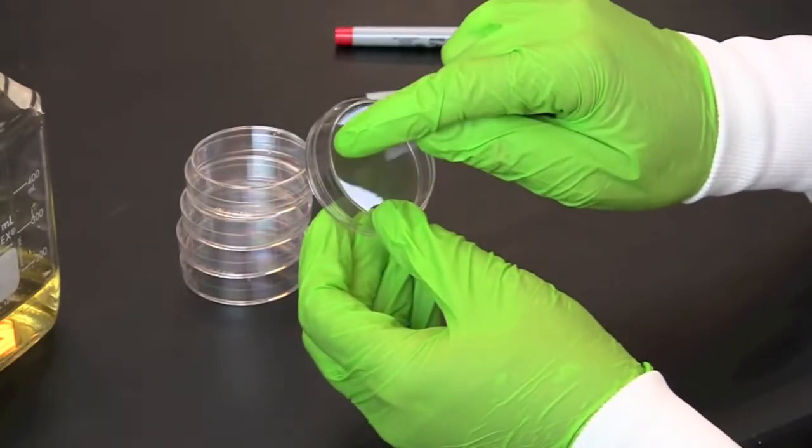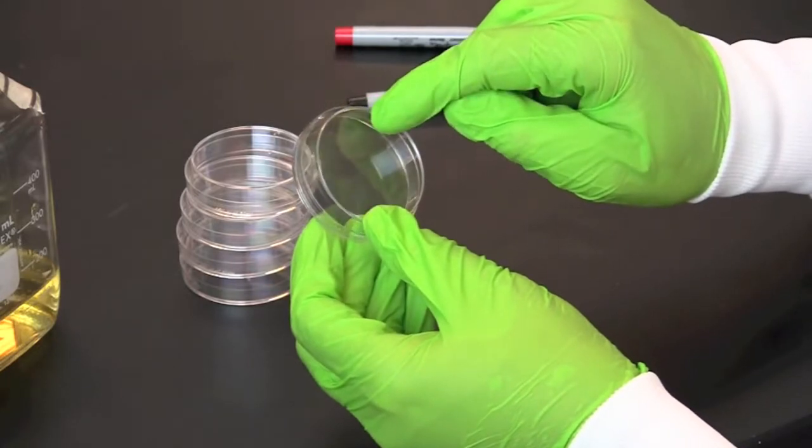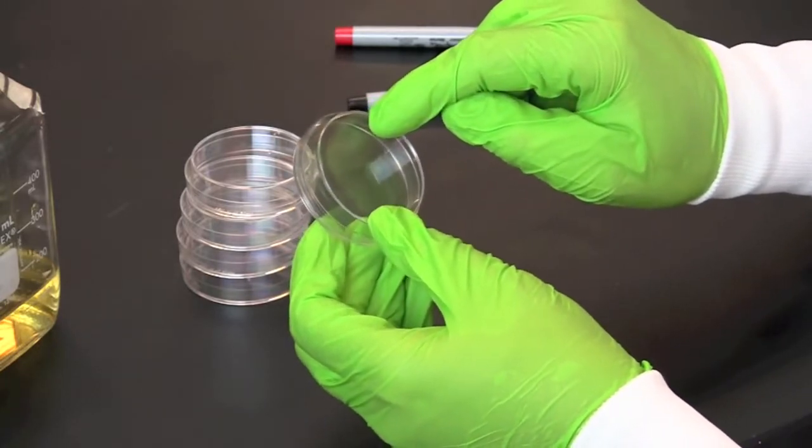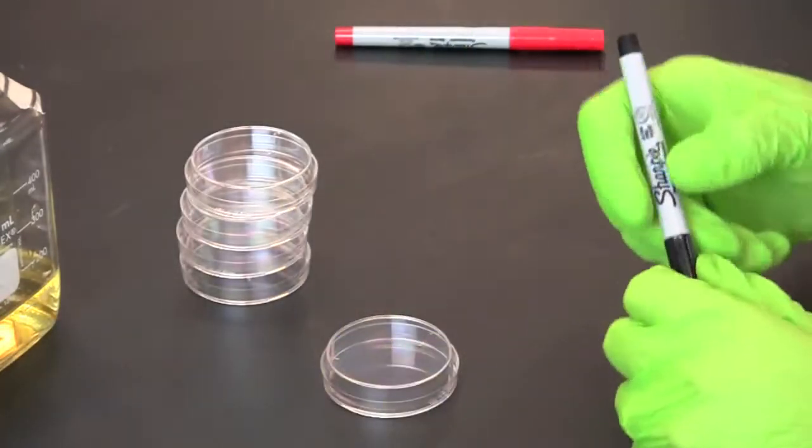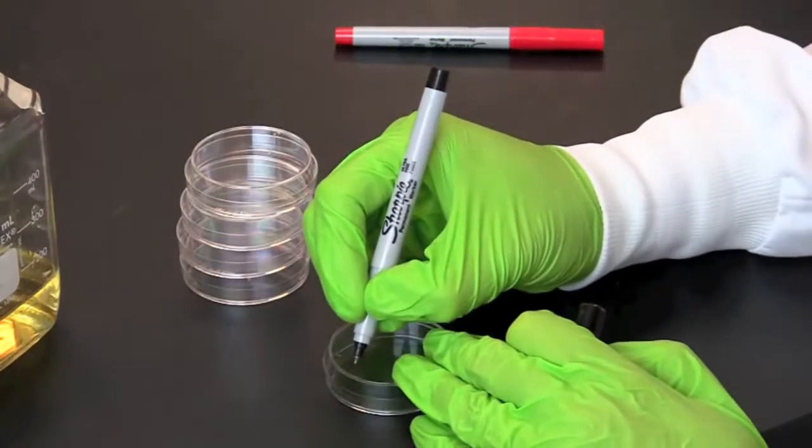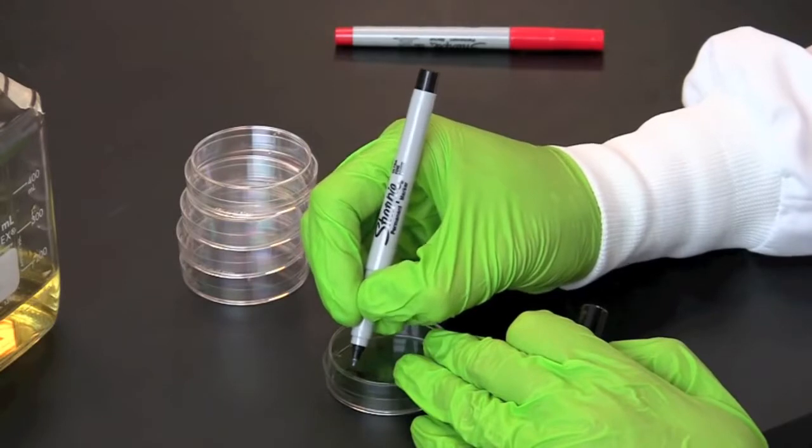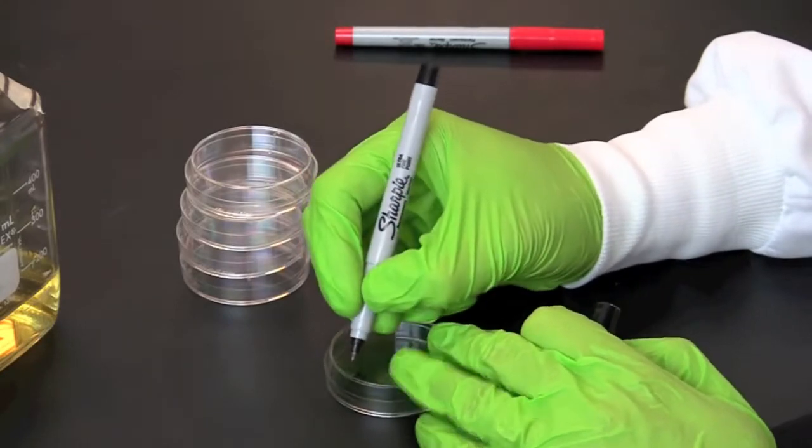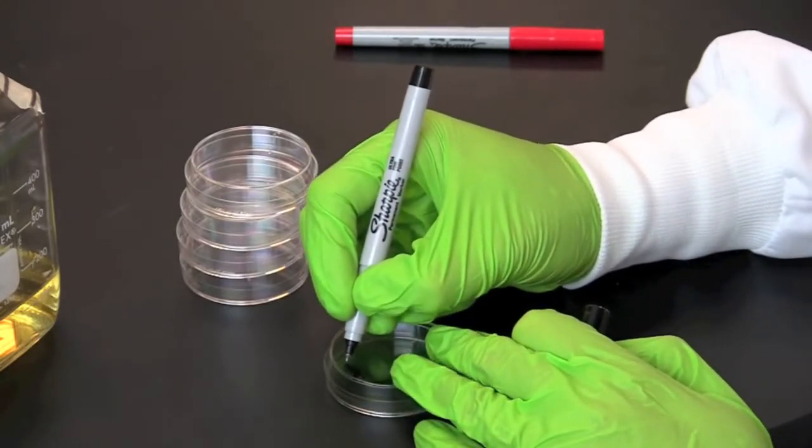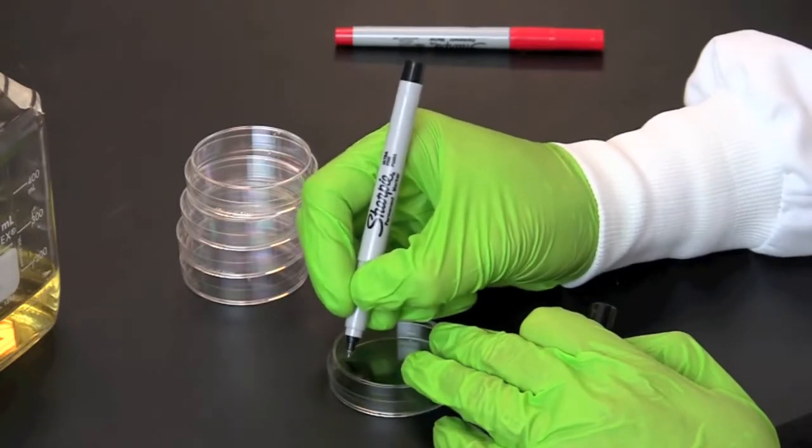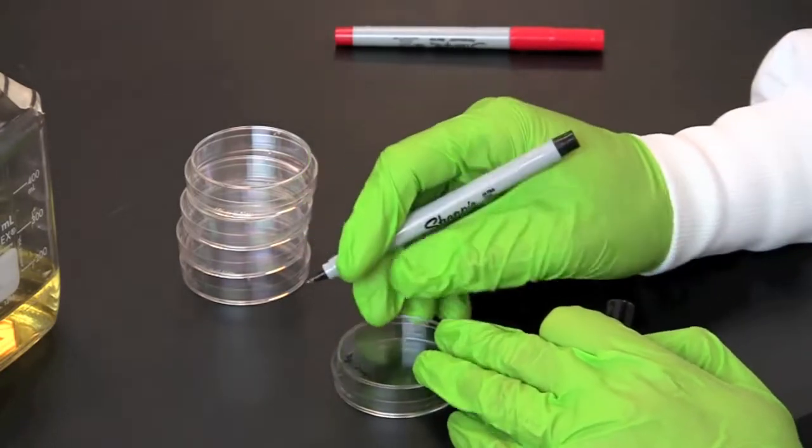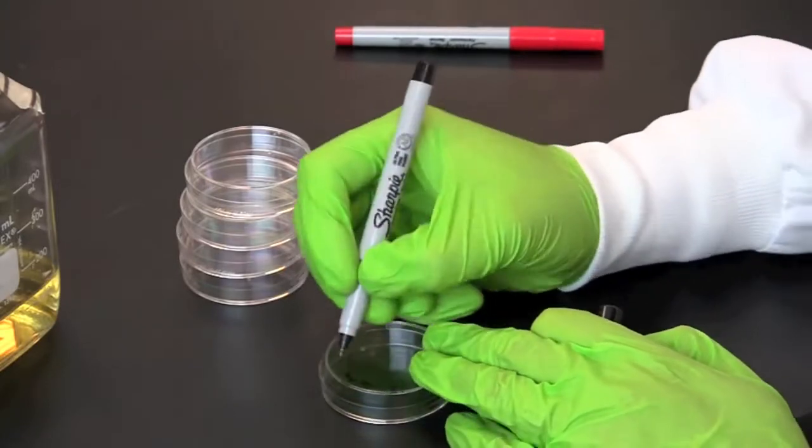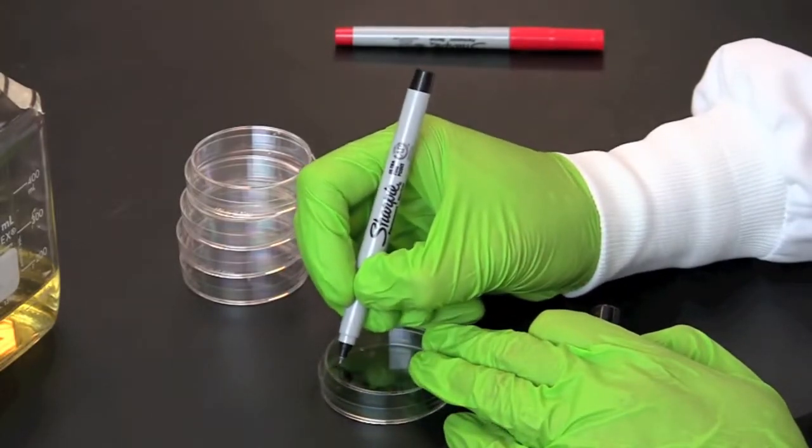Labeling the plates is done in an arch along the outer edge of the base. The information that is recorded on the plate includes the type of agar LB, the type of antibiotic AMP for ampicillin, ARA for arabinose, your initials, and the date.